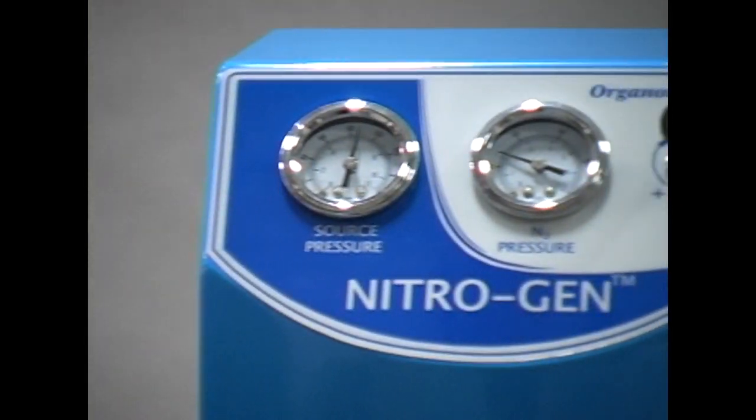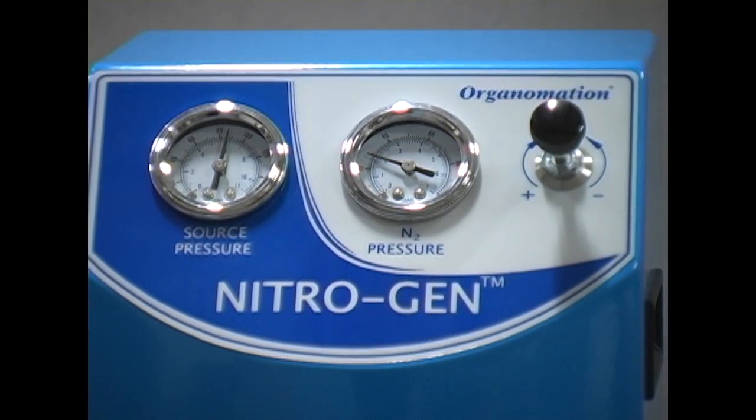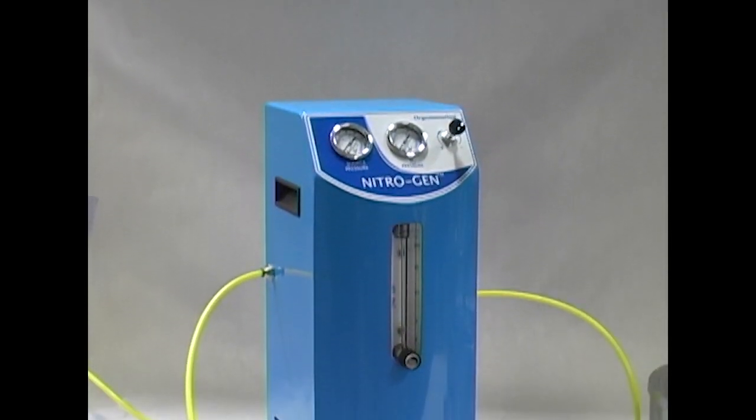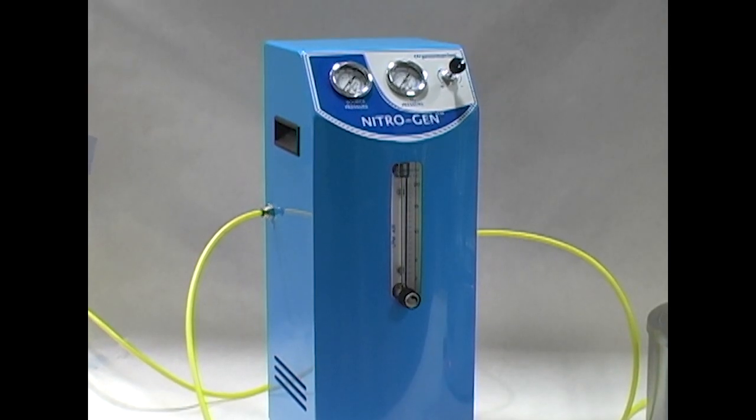Designed for various lab applications such as LC-MS and blanketing, the unit can produce up to a 99% pure stream of nitrogen at up to 20 liters per minute.